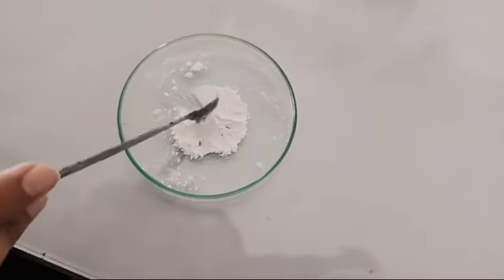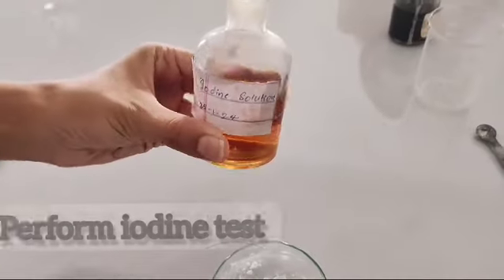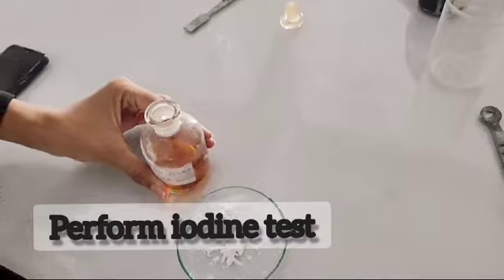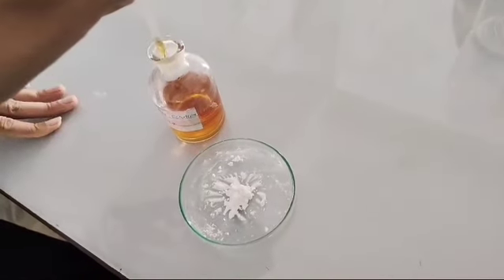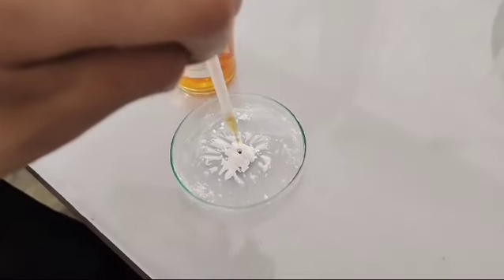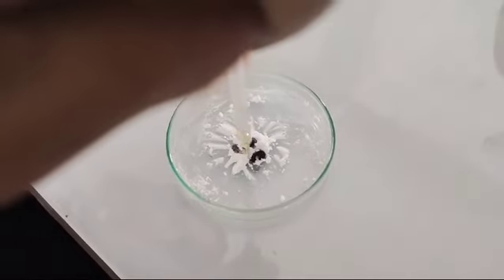Now, we have starch that is present in powder form. Now, we perform the iodine test to confirm the presence of starch. Blue-black color indicates the presence of starch.